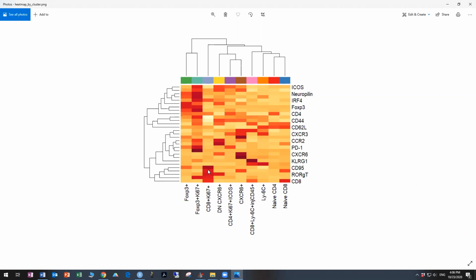And we see now there's a problem here in the naming, in that Ki67 isn't coming up on this side. And what you can see by looking closely is that there's more bars here than there are names, which is because the names in the text is too big to fit with the number of markers that we actually have in the data set. So we need to change the plots in a second, which we will do.